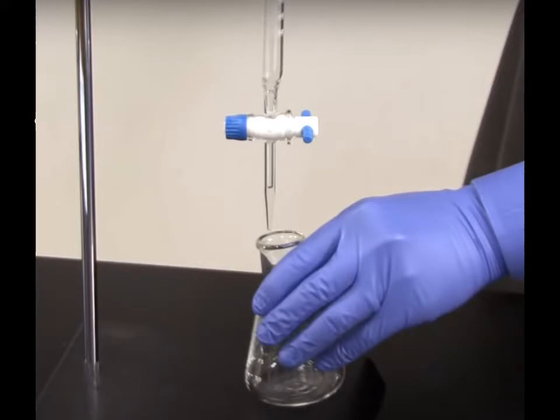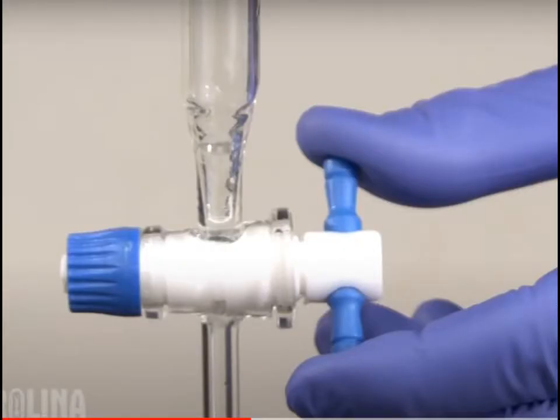So at the bottom of the burette, underneath it, you put your flask. This is the flask that would have our unknown acid in it, for example. You've got it sitting under the bottom of the burette, and it's ready to dispense. This is a close-up of the valve. You can see he's turning that blue part.